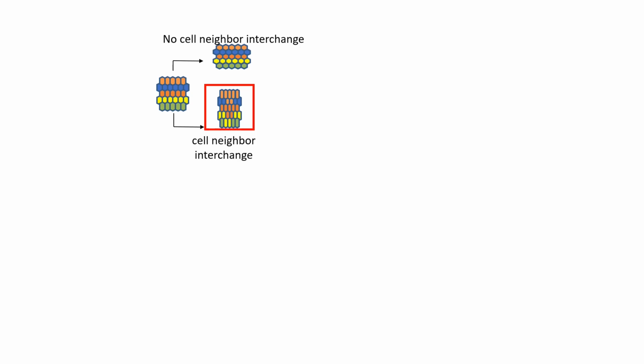Here you find the initial stage of the movies: green, yellow, orange, and blue. And after, in the late stage, we test if the lines remain still together or the cells are mixing or not. So this will be the initial stage, and this one represents the final stage.